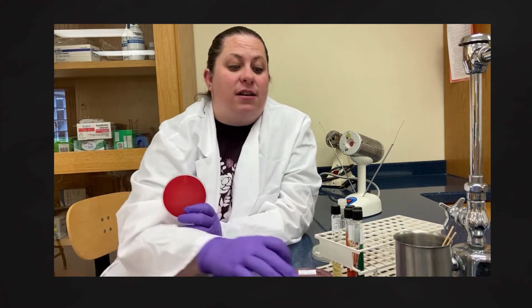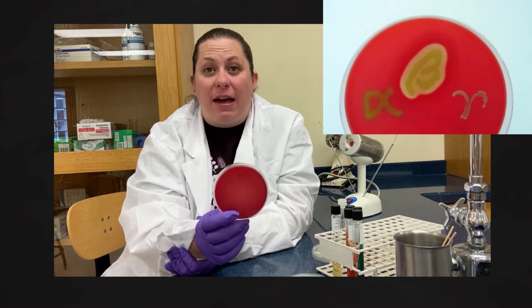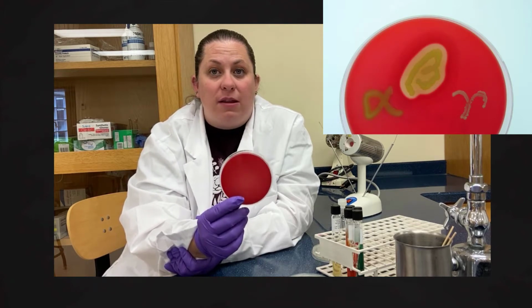Now, sometimes bacteria is just real picky. They can't necessarily grow on something like this, just a nutrient agar. And in that case, we would supply it with what it would want or what it needs. In this case, this is a blood agar, a sheep blood agar. This has blood added to it. And this is going to be for those bacteria who really enjoy blood, like hemolytic bacteria. Okay, they like to lyse the blood cells and get the components out of them. And so because of that, this would be one that they could grow on.